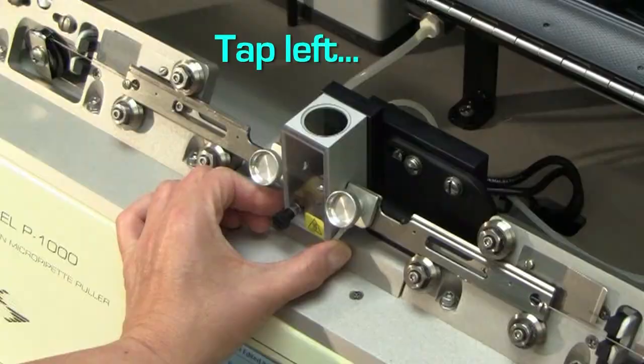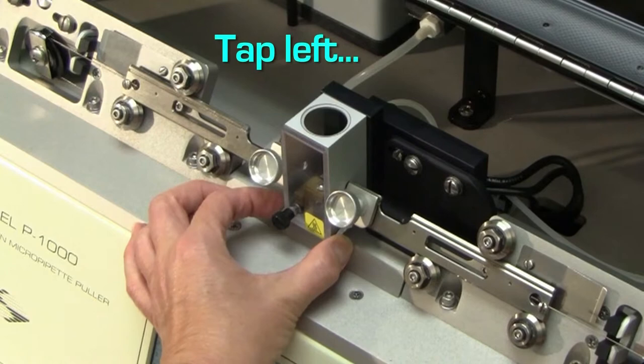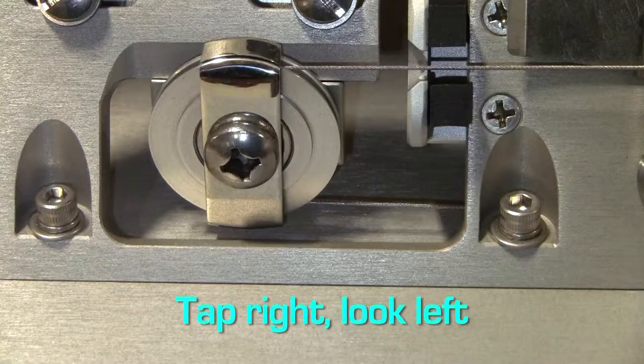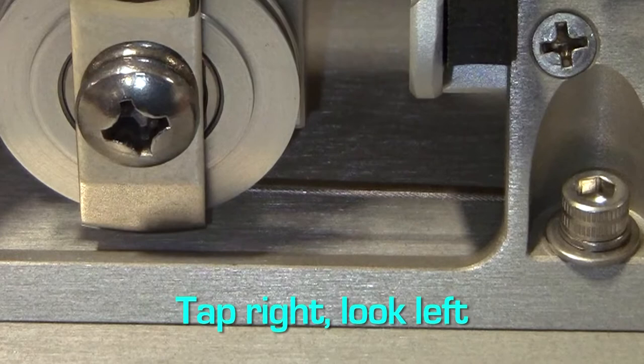Pull the puller bars all the way together. Now tap one puller bar against the hard stop and watch the lower portion of the pull cable on the other side. You should see movement that corresponds to your tapping. Reverse sides and repeat. If you see the movement to about the same extent on both sides, you're good.